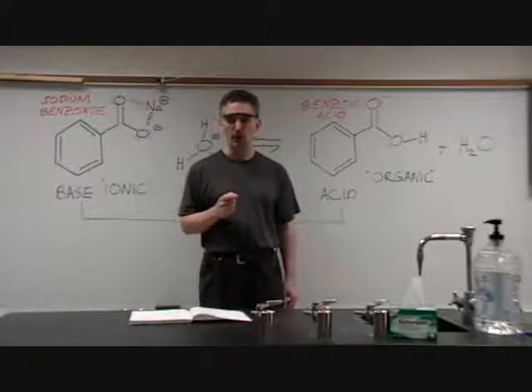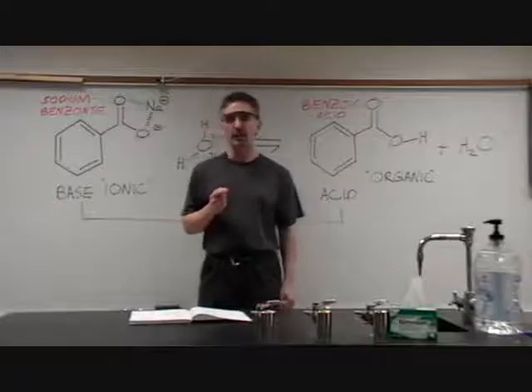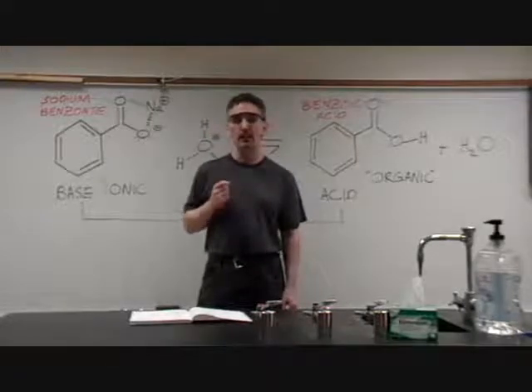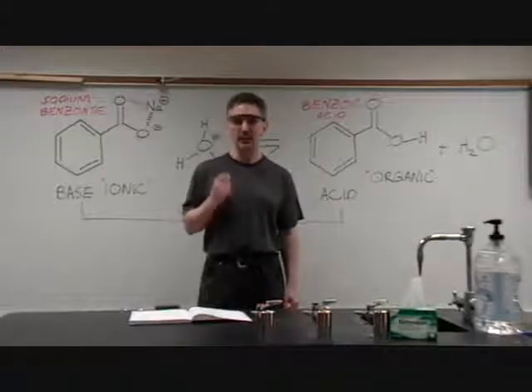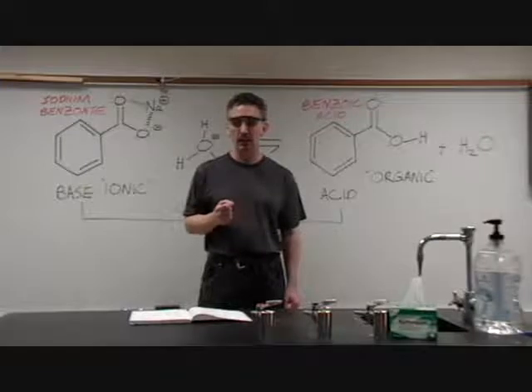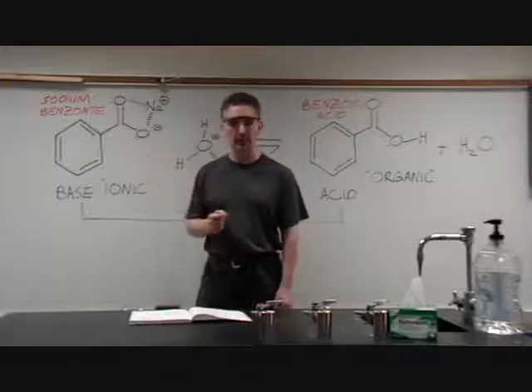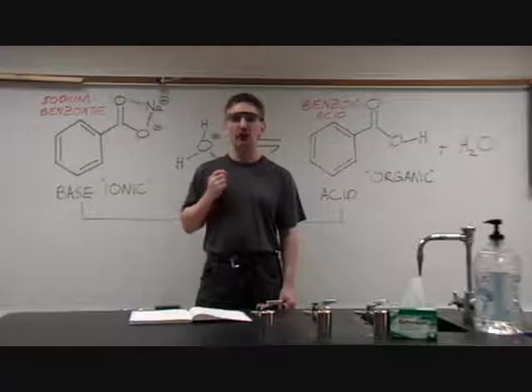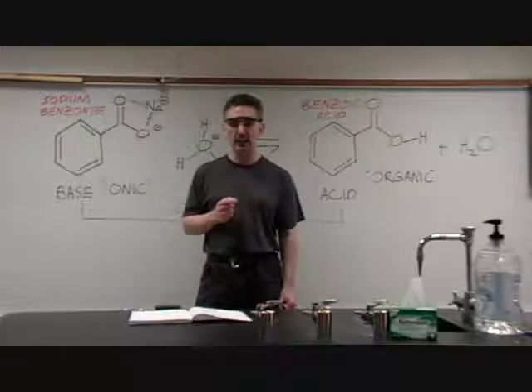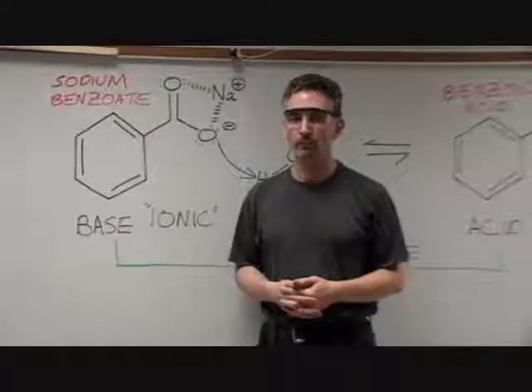So your job is to refute this claim that the sodium benzoate chemically changes in a human being's stomach. So you're going to have to recreate those acidic conditions of the stomach by taking the sodium benzoate and dissolving it in water and then adding 3 molarity hydrochloric acid until you get to a pH below 2.